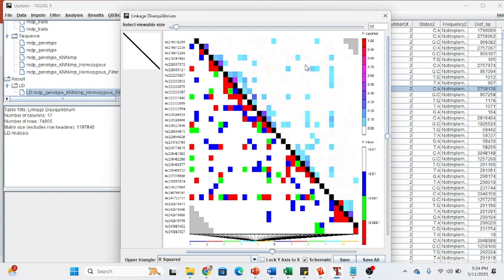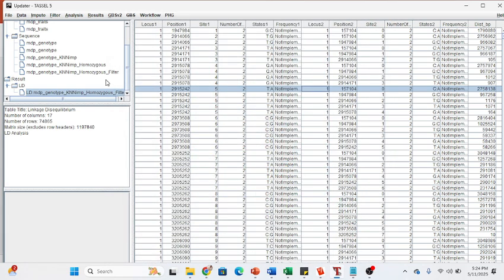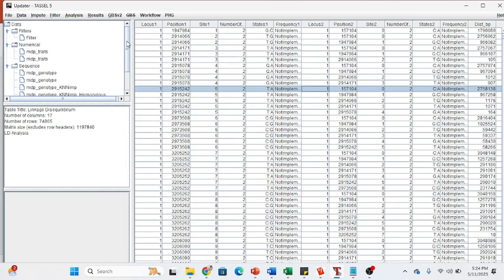Now this side is your R square value. If R square is more than 0.5, we consider it a good SNP, or we can say LD is there. You can also check the p value. You can see the scale from 0 to 1. I'll explain how we should consider this and what the significance of this LD map is. We have to check the LD before we perform analysis.